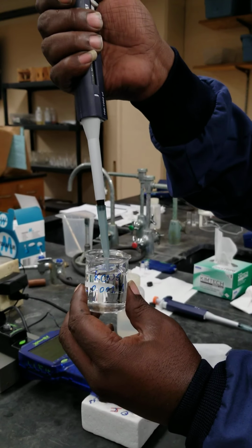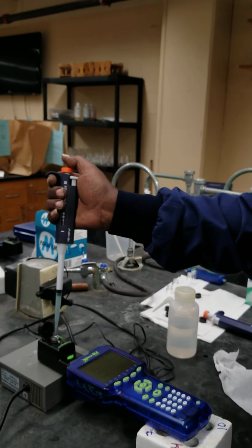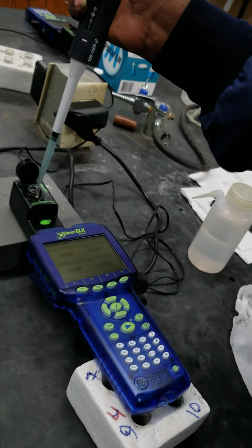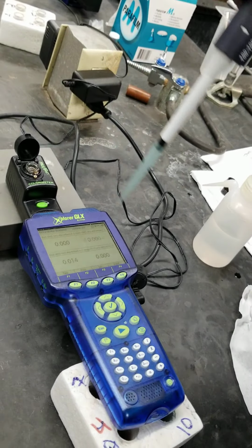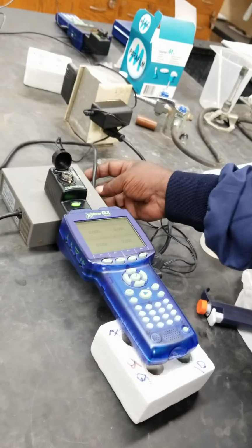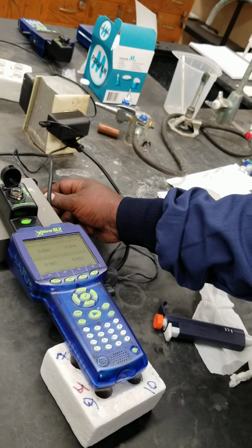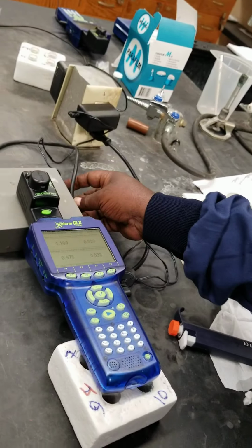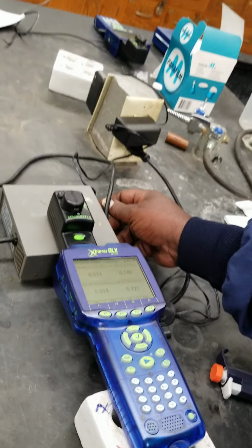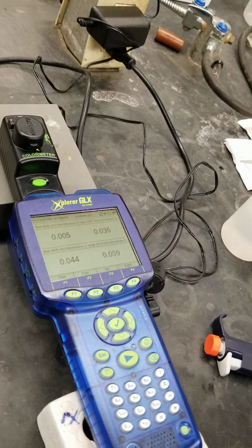Go down, take it up, put it in. Then I'm going to stir with my stir bar. Close that. Turn that off.